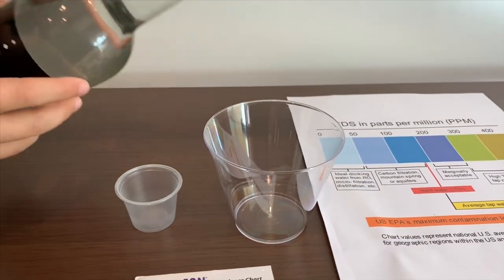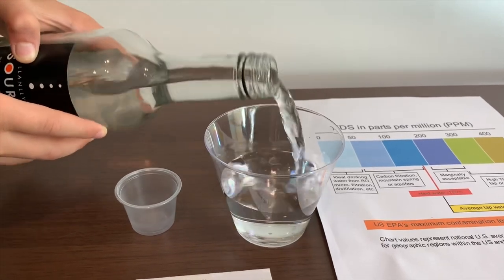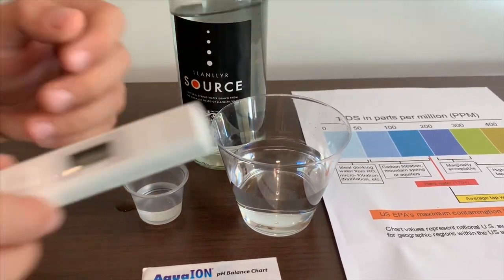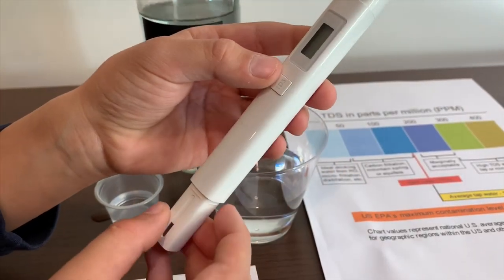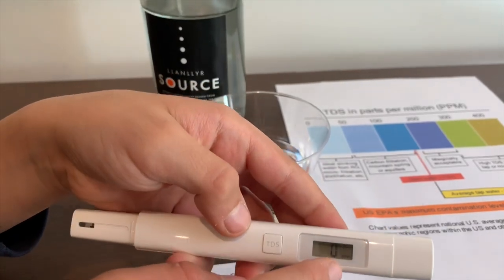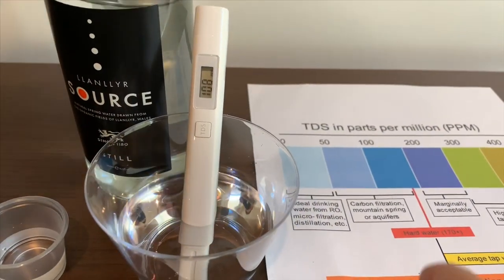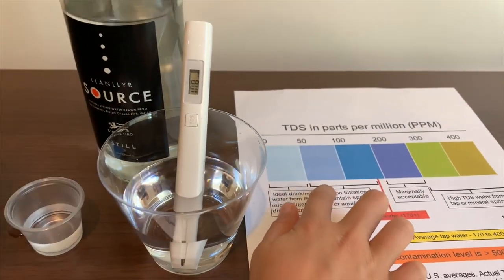Let's pour some water in. First we are going to test the TDS. If you want to buy this TDS tester, check the link down below. Turn on the TDS tester, make sure it says zero and put it in. It is 108. That is okay to drink.